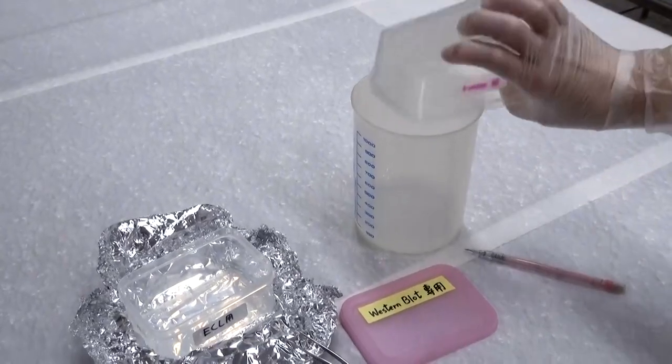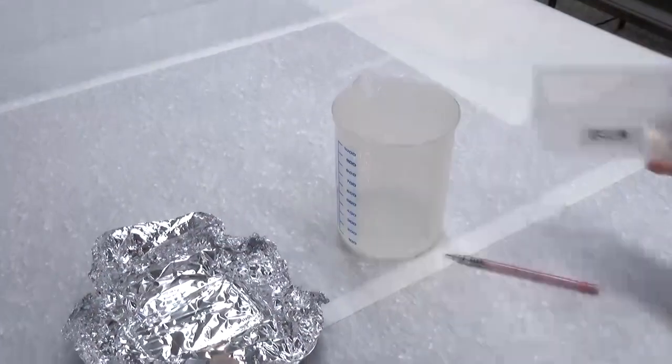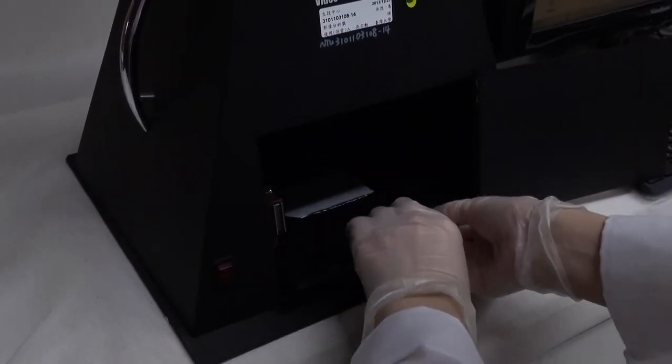Adjust the exposure time according to the actual situation and keep a record. Clean up the dark room after the experiment. Carry away all objects that have been brought in and quickly leave the dark room.